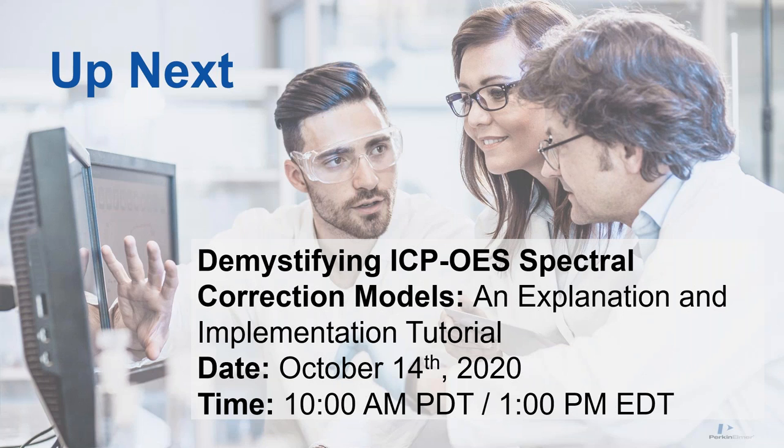I think the question is also asking, how do you know the concentration of the interferent? Essentially, you just have a single element standard of the interferent and run it in a similar concentration as the analyte. Right. Exactly. Exactly.